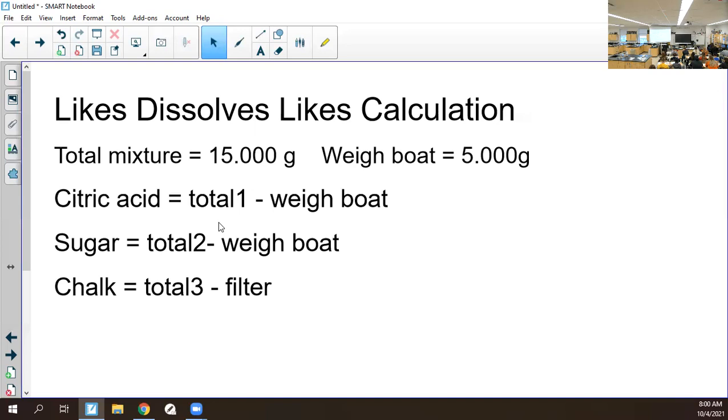We like that. Okay, and so then for our last one, we've got mass of dried chalk and filter paper. Okay, so if we've got chalk and filter paper, let's say it's like 1.5 grams total of chalk. Or sorry, 2.5. I'm doing this backwards again. 2.5 for our mass of chalk and filter paper. And then again, I totally just spoiled how much is going to be just chalk, but what's the answer? We've got 2.5 minus 2, we're going to have 0.5 of just chalk.